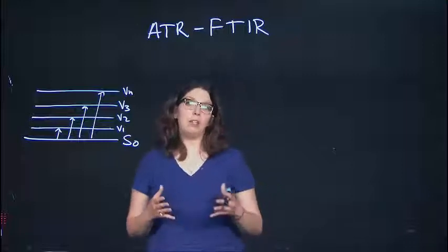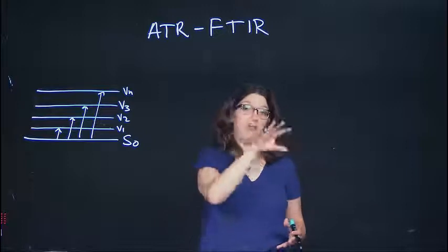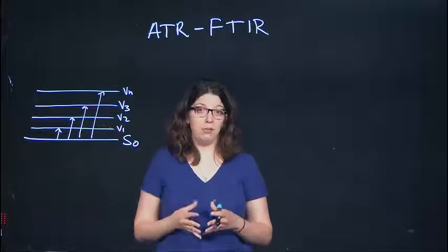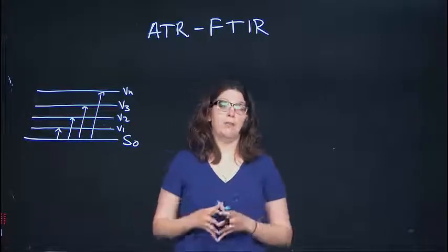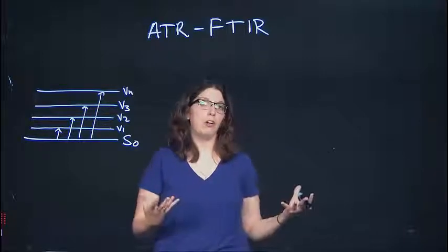In the attenuated total reflectance Fourier transform infrared experiment, or ATR FTIR, you're going to be measuring the concentration of ethanol in various solutions. Okay? And we're going to do so in percent. Okay, so percent ethanol in various solutions.